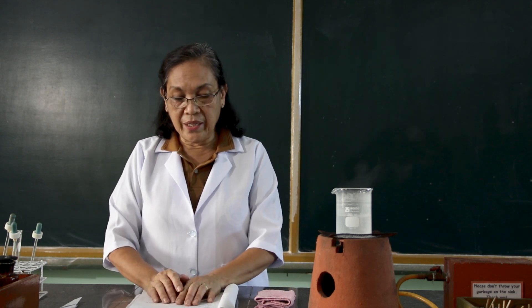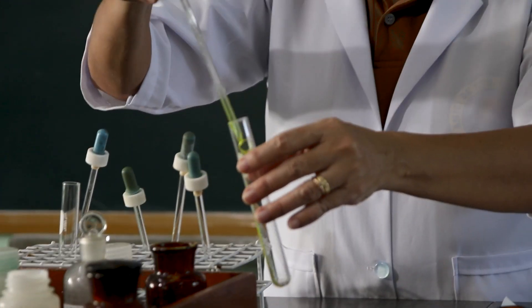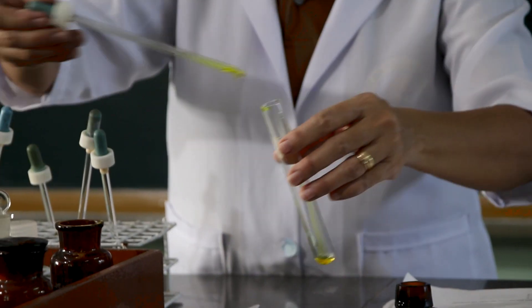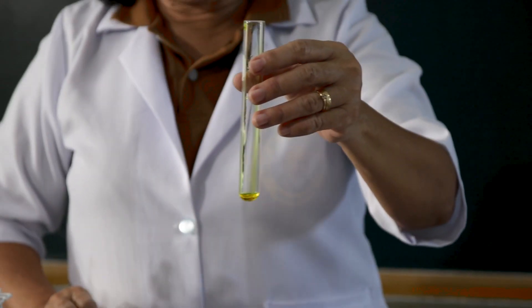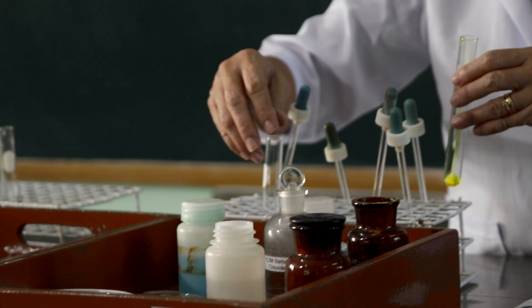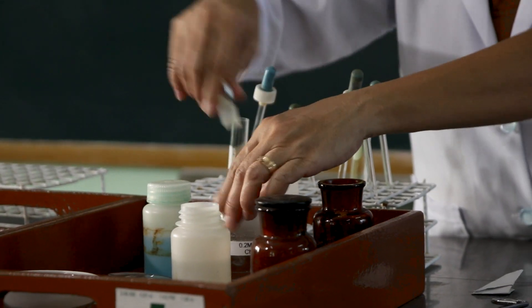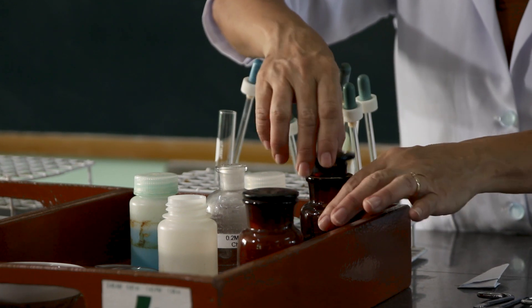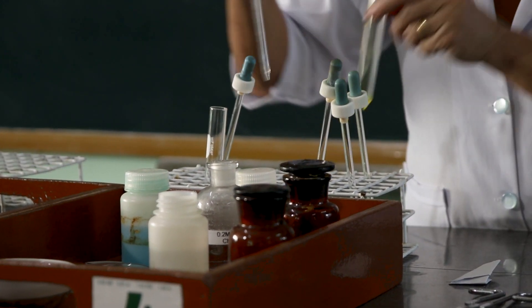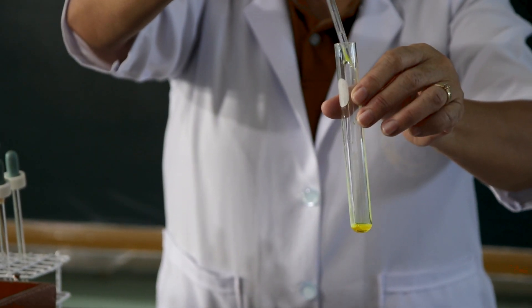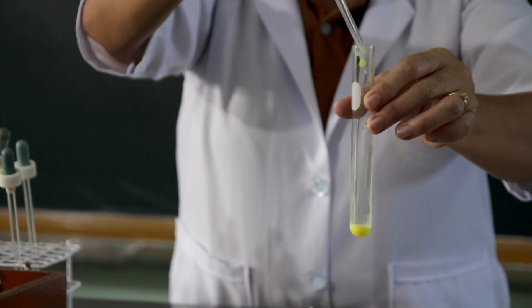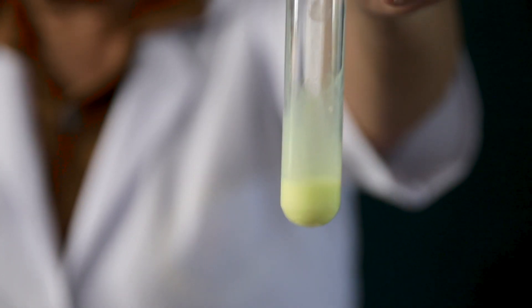Then we will prepare a salt by a reaction between two other salts. This time we are going to use the potassium chromate and the barium chloride. We will add the potassium chromate with the barium chloride. I want you to observe what happens.